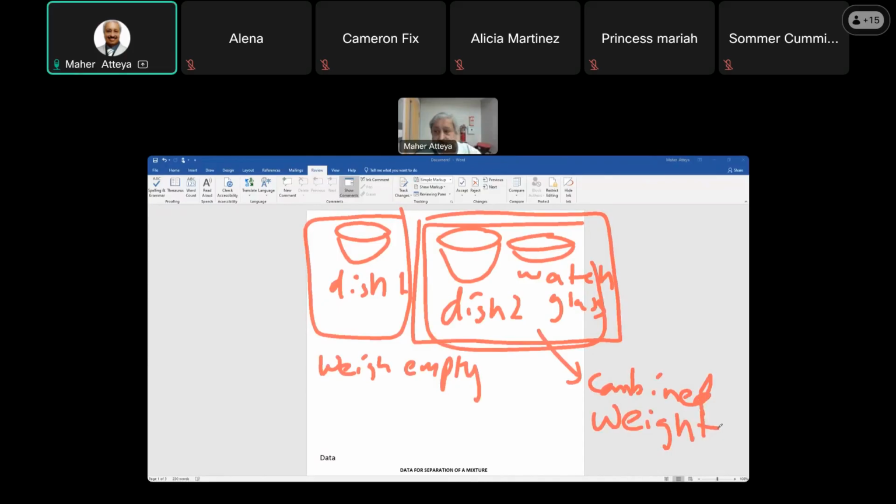This is the picture of the evaporating dish. Those are the dishes here, evaporating dishes. They look like this. Take the one that has depth inside, because we will add some tap water into them. So don't take the flat one, but take one like this. Dish 2 is the same thing, plus a watch glass from your drawer. Correct, guys? So you have 2 of those empty.